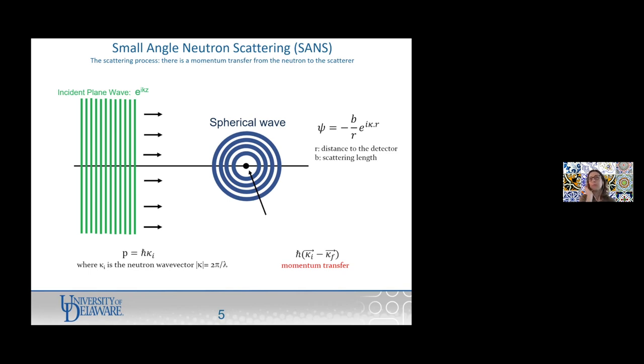In fact, you should come into a SANS experiment with as much accurate information as possible from a range of techniques. You should know the purity of your sample, the percentage of deuteration, the concentration, an average size, what to expect. Because there are a lot of parameters to determine and comparatively not much data from SANS, if you want an accurate answer to your experiment, you need to use complementary information so that you have a full story. It is possible to fit a SANS curve with the wrong model, and you can have a very nice fit, but the model be wrong. So you need to know that the model makes sense for your sample.